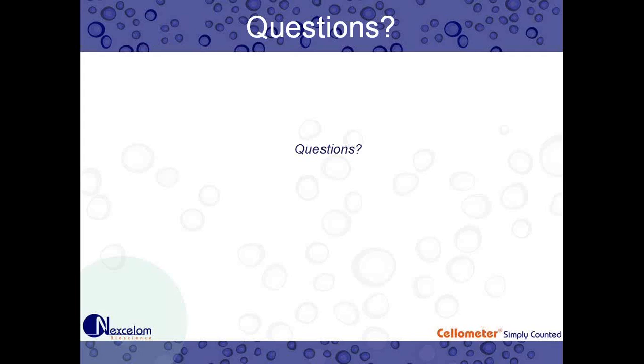And it looks like you have another question about your hemocytometer manual counting not correlating specifically with viability percentage. If that is okay with you, what I'll have is one of our tech support reach out to you after and just talk through the problem a little bit after this webinar, and they can assist you with optimizing that for you. Of course. Okay, and do we have any other questions?